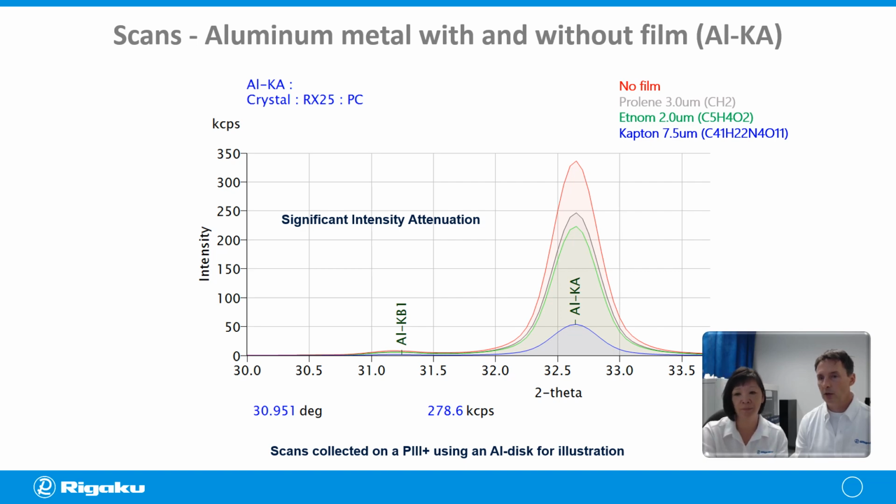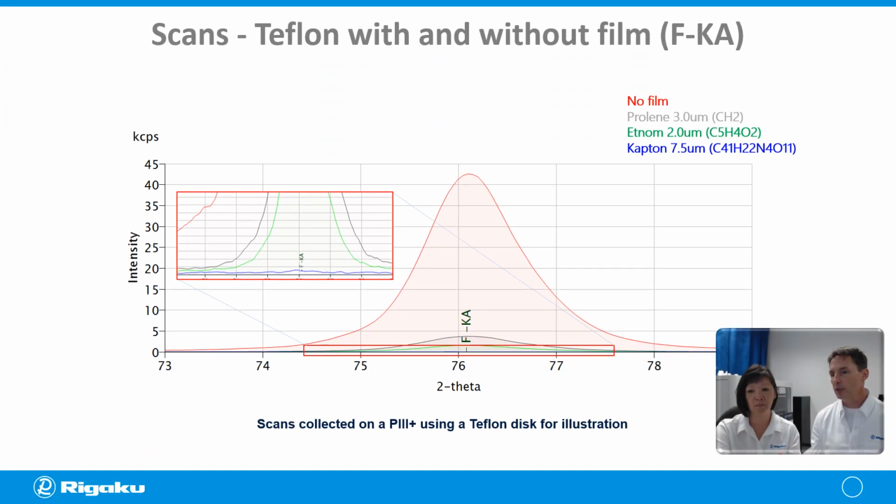Right. My background was in organic, so I knew about 4 elements on the periodic table. Now, since doing this for a while, I know a good portion of it, and so you just consult the table and go, oh yeah, that element's light or that's heavy. And actually, there's a lot of good guides to show you what kind of signal you get and what the wavelengths are. It's all known quantities.